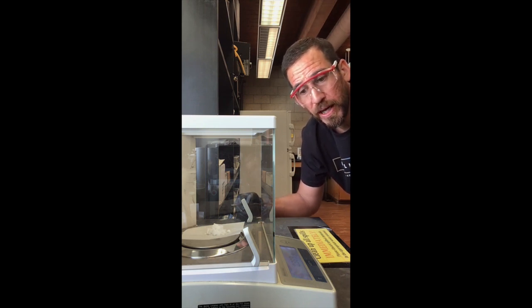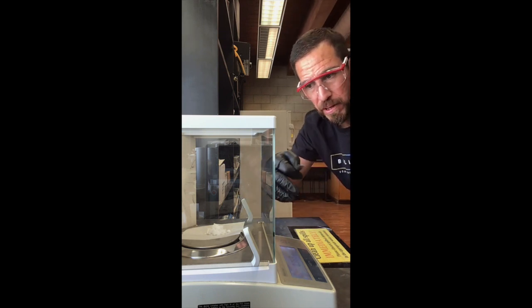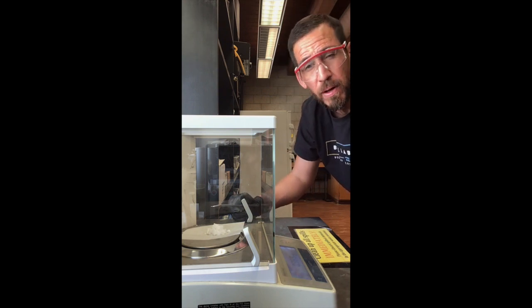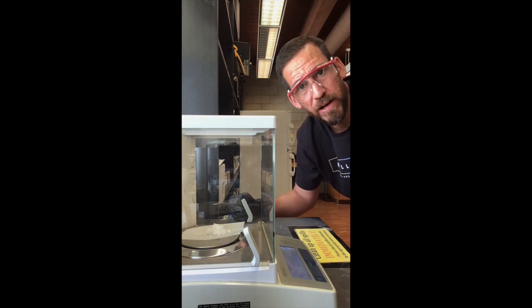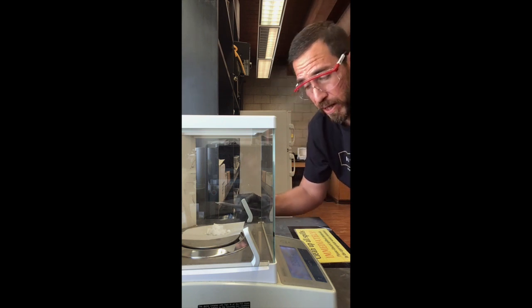So again, I would show you, but the scale is actually, as I mess with it, I'm touching the table, it's going back down. So again, let's just call it 373 milligrams, so 0.373, okay? And then what you want to do is that number divided by 508 times 100%, and that's going to give you your percent recovery, okay?